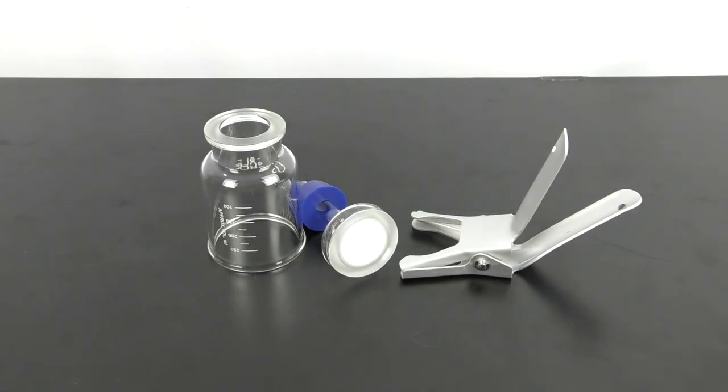This vacuum filtration set is designed for bacteriological analysis of water, but is also useful for analysis of suspended solids in water.